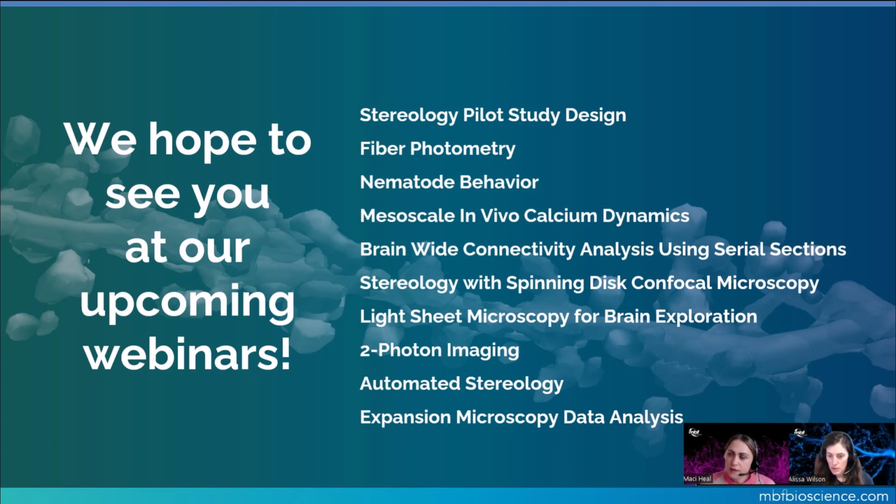So that reminds me, not a question, but a point that the Neurolucida 360 software does accept many imaging modality inputs. Yeah. So it's not TIFF only. You can use a wide variety of proprietary formats, ND2, LIF, JPEG 2000. The list is quite long.